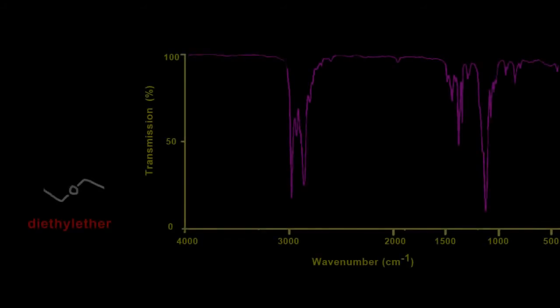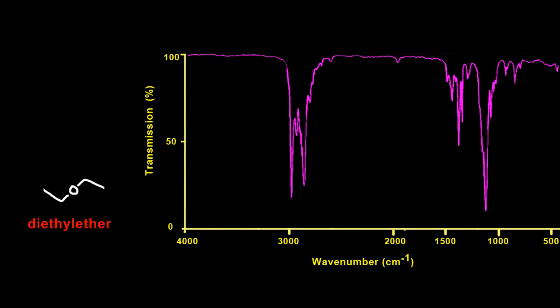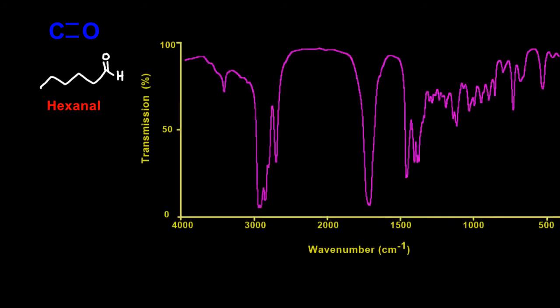For identification of the ether group, for example, diethyl ether shows the carbon-hydrogen bond at 3000 and the carbon-oxygen bond at 1100 wave number. Let us look at the identification of oxygen-containing carbonyl compounds: aldehyde, ketone and carboxylic acid.